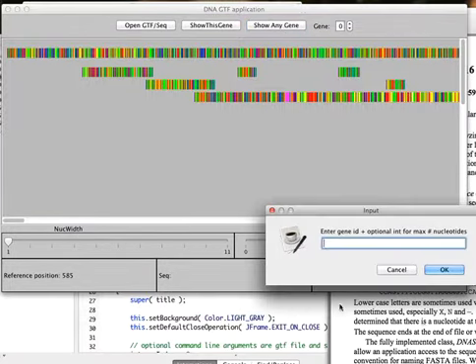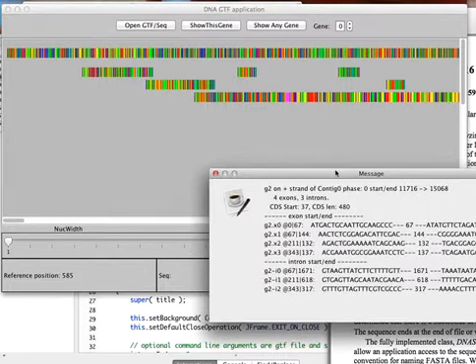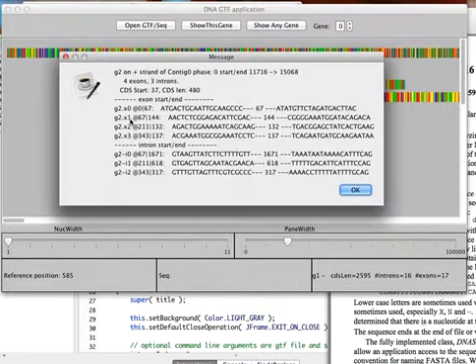So at show any gene, we can also show G2, and I'll just show that because they are quite different. I'll do 20 this time. You don't need to do that. But so gene 2 is much shorter. It only has 480 nucleotides in the coding sequence, and it only has 4 exons and 3 introns.